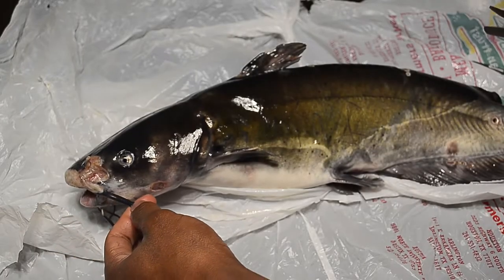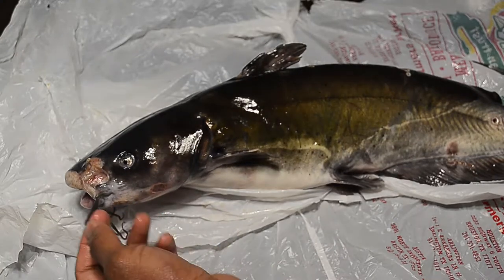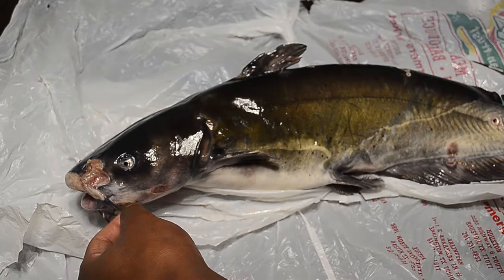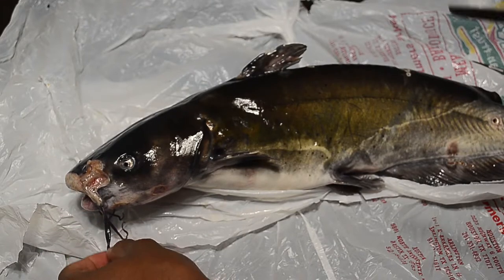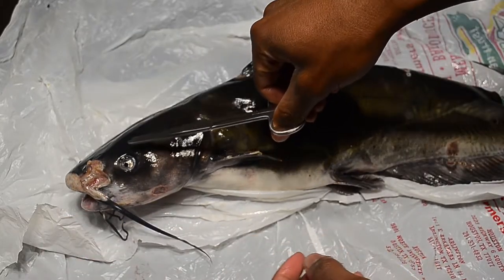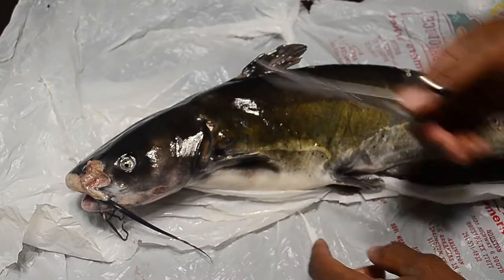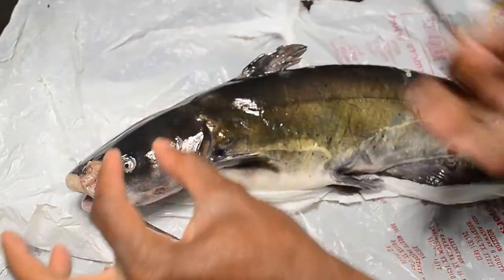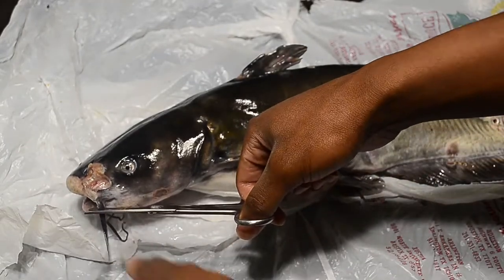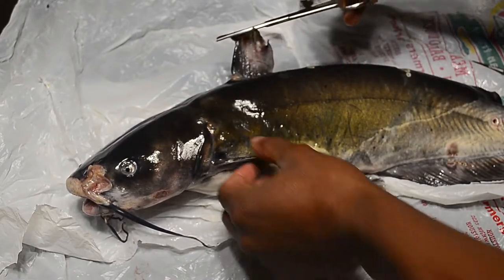First we have the whiskers, or the barbels — they're called barbels on fish. These barbels are actually covered with a bunch of taste buds, and the nickname for catfish is the 'swimming tongue' because they can actually feel and taste their surroundings in the water with their barbels. Their eyes are super sensitive — when we dissect other fish we'll see their eyes are much bigger in proportion. Even really big catfish have eyes about this small, because they usually live in murky waters and use their whiskers to feel around.